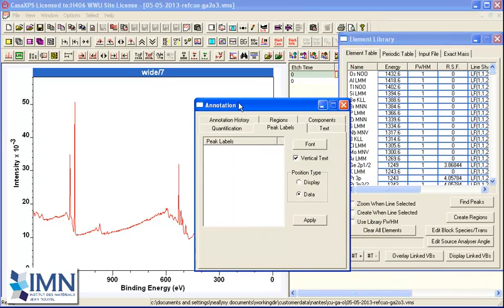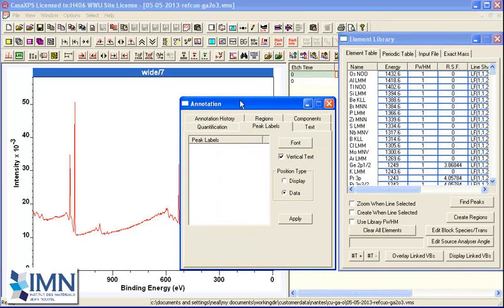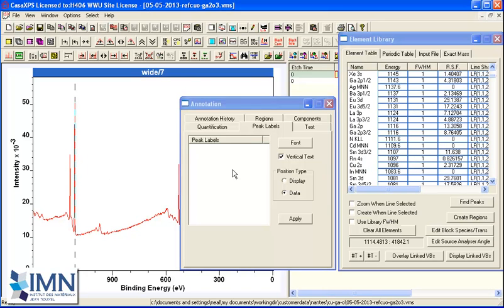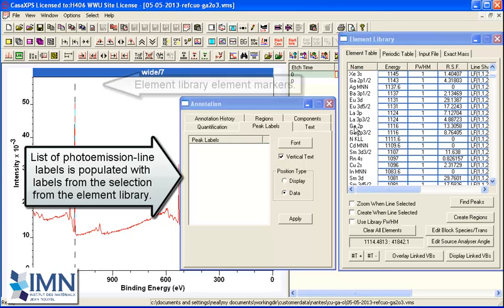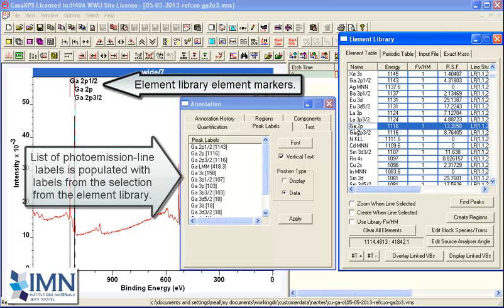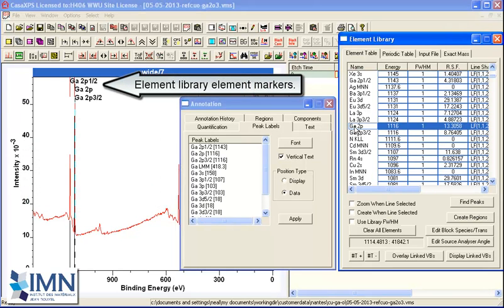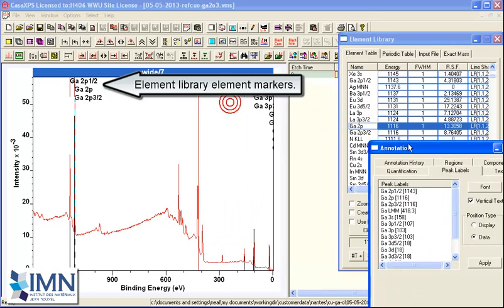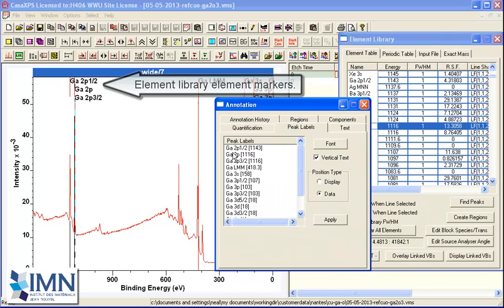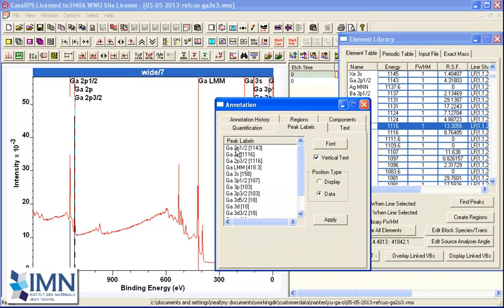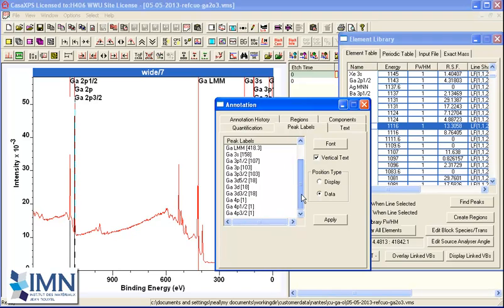When I make a selection over the spectrum, the element table scrolls and I can see the transitions that are around the energy that I've just clicked on the display. If I select one, it puts up element markers and you can see the same element markers appear in a list on the peak labels property page.